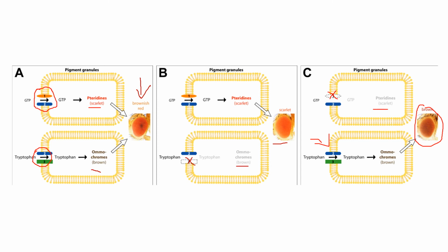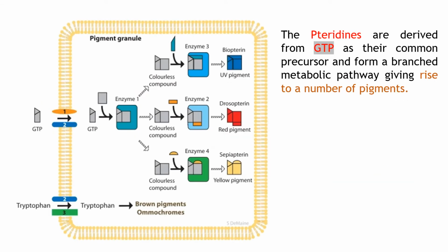So now I have one question. What happens if transporter number 2 is not working? What do you think is going to happen? And in the lab, we will try to answer that question. In other words, we're going to try to identify it with chromatography and try to identify in which component you will find a defect.